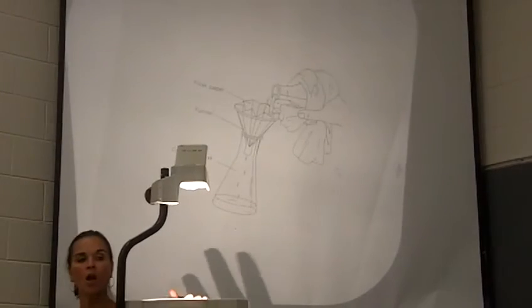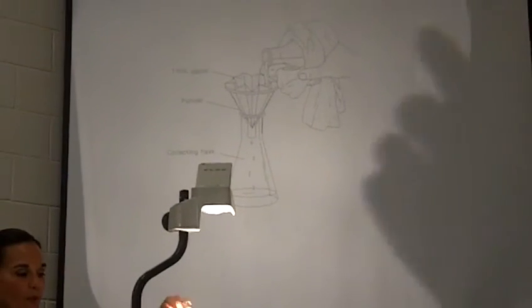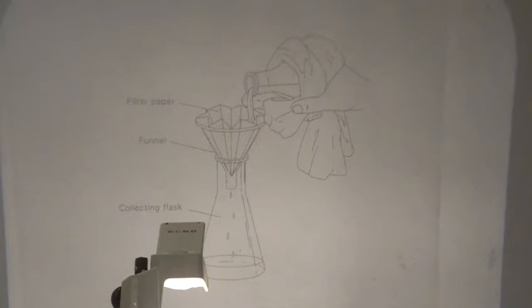So when we go to filter our nutmeg, we're going to be using gravity filtration. A few of you had to use gravity filtration in experiment 1. All of you will get to use gravity filtration in experiment 3. We don't need the towel around our flask though, because we're doing things at room temperature. It won't be heated, okay?